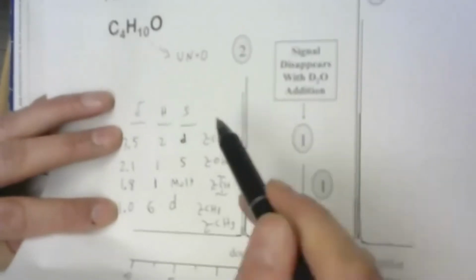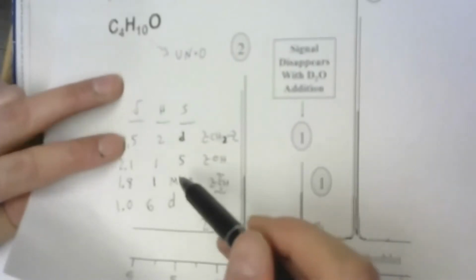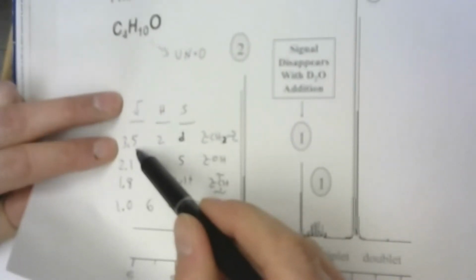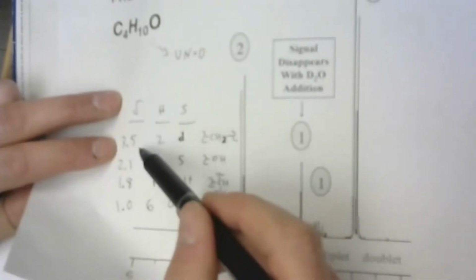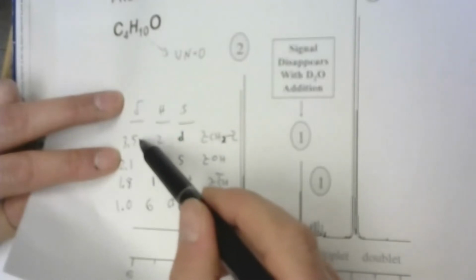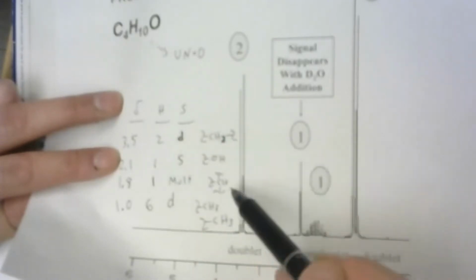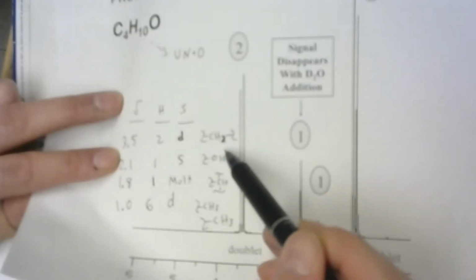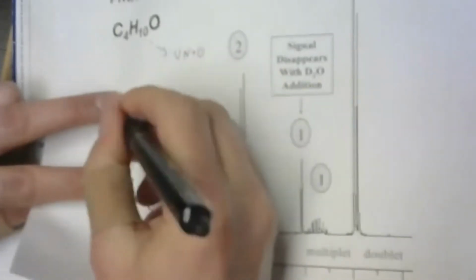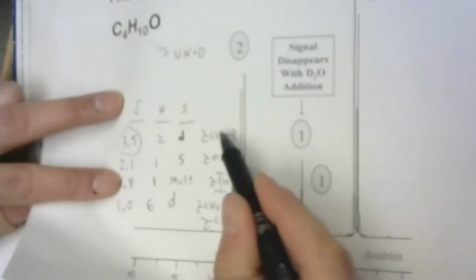How do I snap this guy together? Anything that really stands out? Just because we're basically over time, I'm gonna say maybe 3.5. What does that mean? 3.5 tells you what about the CH2? If you look on the chart, there's only one thing that comes between 3 and 4, and it's protons with a carbon next to an electronegative functional group. What electronegative functional group do we have? The OH, right? So this 3.5 is critical, and it means the CH2 and the OH are connected.